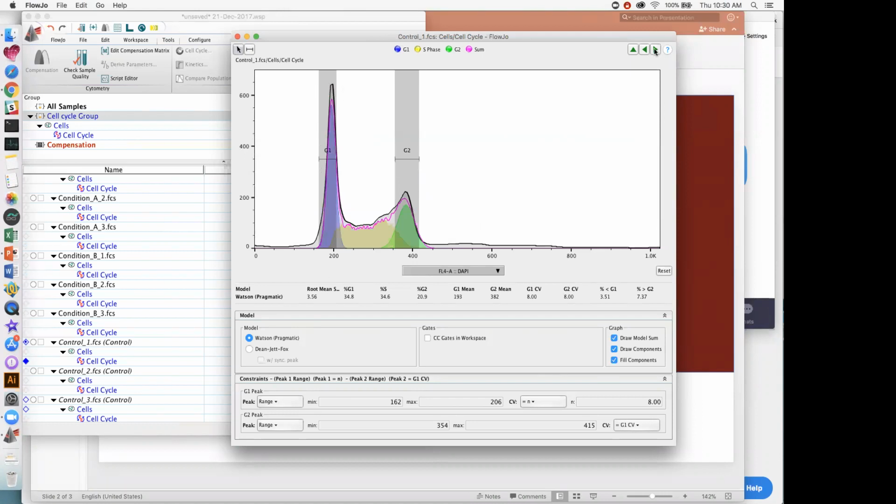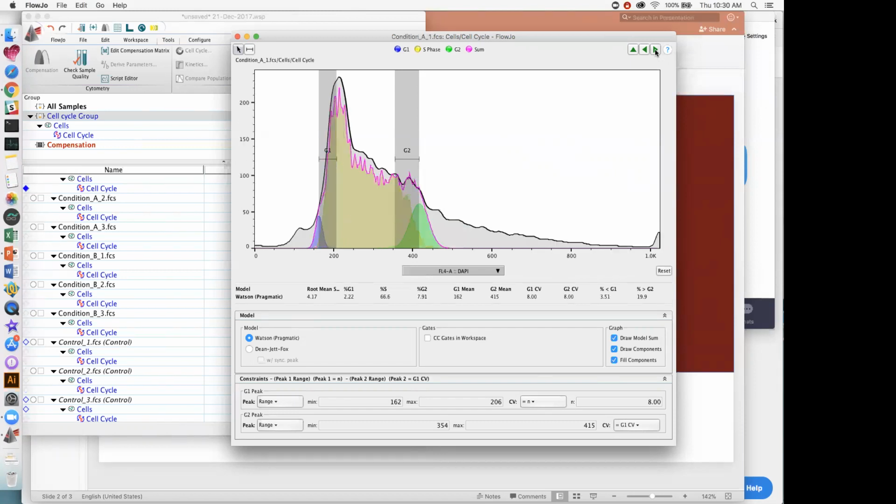This is an interesting data set in that the peak here is okay, but in some of the other treated samples, the model actually prefers the bin towards the right. Okay, this actually looks okay.